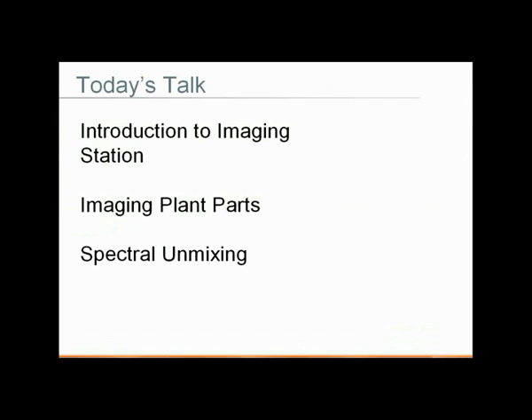So first we'll just take a quick look at what we're going to talk about today. I'm going to introduce you to the in vivo MSFX Pro and then go into imaging by parts of a plant, and then finally end up with spectral unmixing and how that can be important for fluorescence imaging in particular.